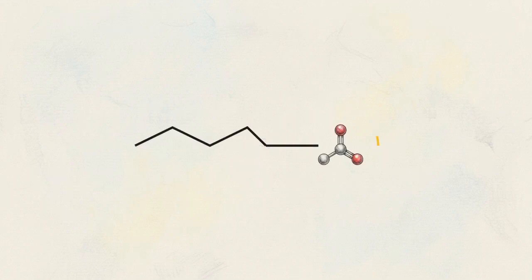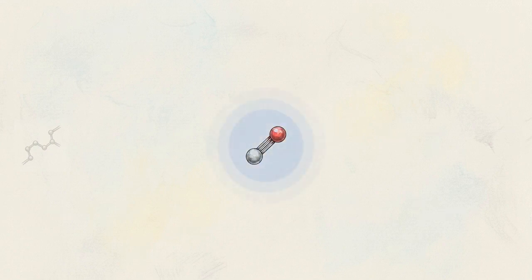We see this clearly in the alpha-cleavage of a carbonyl group. Single electrons, indicated by fishhook arrows, shift to form a new double bond while breaking the carbon-carbon connection. This process ejects a neutral alkyl radical and leaves behind an acylium ion. Because the positive charge is stabilized by resonance with the oxygen atom, this is a highly favorable outcome.